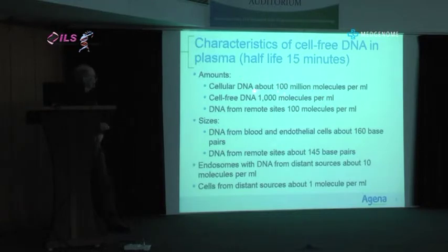The problem we have in doing, and Darryl's already talked about this, doing cell-free DNA measurements in plasma is that the overwhelming majority of DNA in plasma is cellular. So if you break any of the cells, you've ruined the sample. Okay? And Darryl showed you one way to use QC to check to see if you've broken any of the cells.